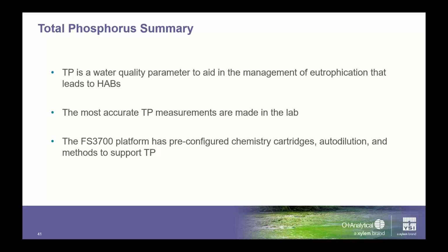Phosphorus, you can't really look at that way, because the one exception is the IQ SensorNet system, which is a very popular system that Xylem produces for measuring a lot of different things in water. It is still a wet chemistry system, and it does come equipped with a full telemetry system that can be fully integrated into your SCADA in a wastewater treatment plant. So that is a phenomenal system.